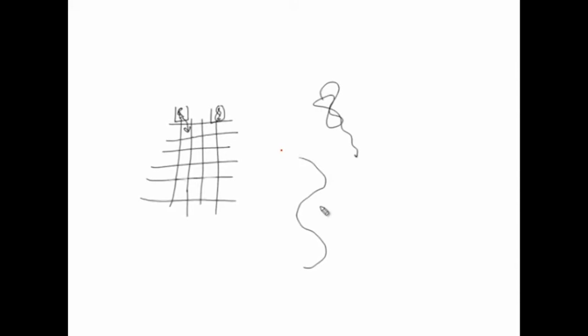Now, molecules above 20 kb moving in this agarose gel, after a very short while, as the leading front goes and the rest of the DNA follows, become entangled in this meshwork, so much that their movement is impeded. They are not able to move further.